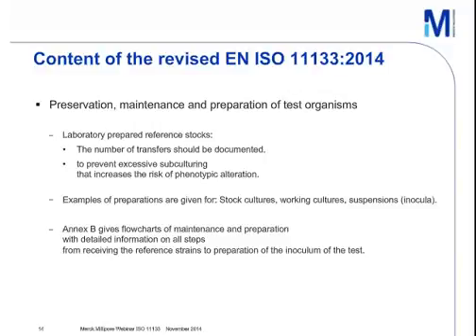Examples are given for preparation of stock cultures, working cultures and suspensions, inocula. Annex B of the standard gives flowcharts of maintenance and preparation with detailed information on all steps, from receiving the reference strains to the preparation of the inoculum for the test.